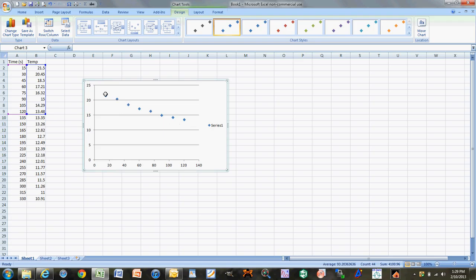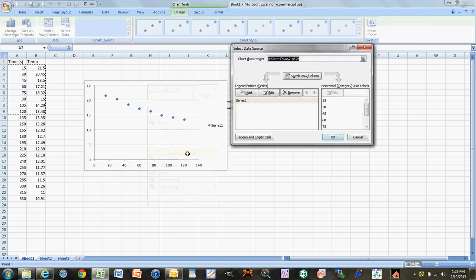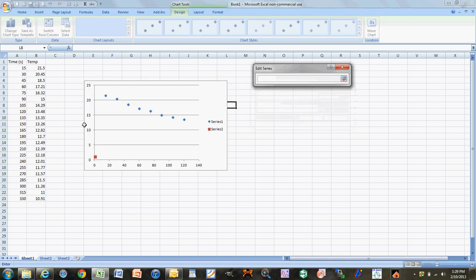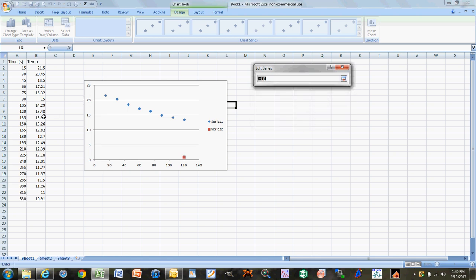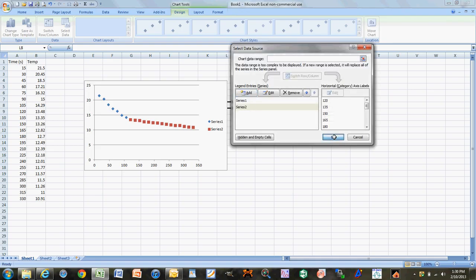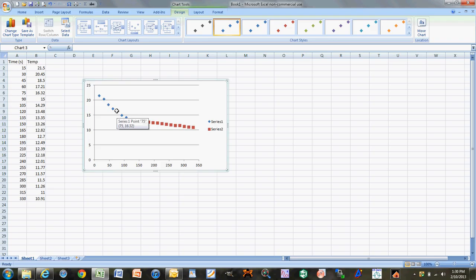From there, click on the graph, right-click, and select 'Select Data.' From here, add another series and select your x-values — starting from 120 seconds all the way down to the rest of your data. These are your x-values for time, and then select the y-values accordingly. Now you have two different series on the same graph, which allows you to plot two different best-fit lines.